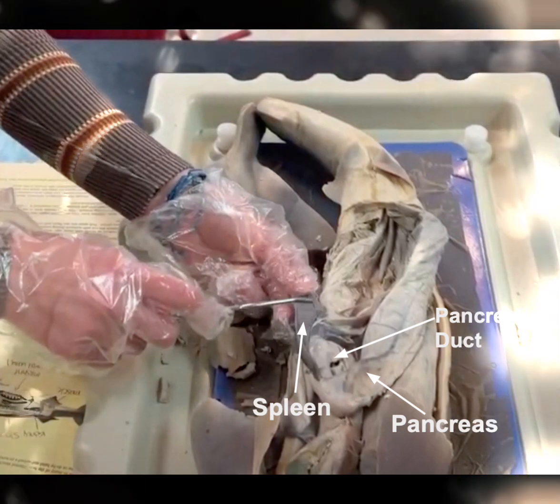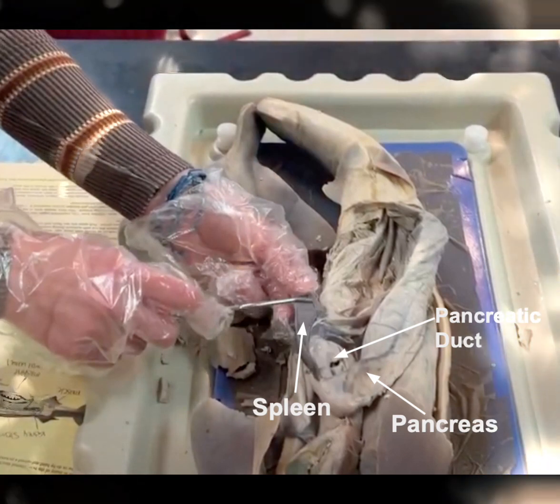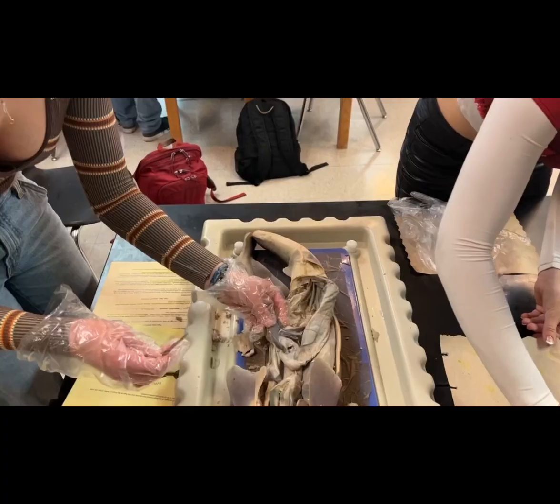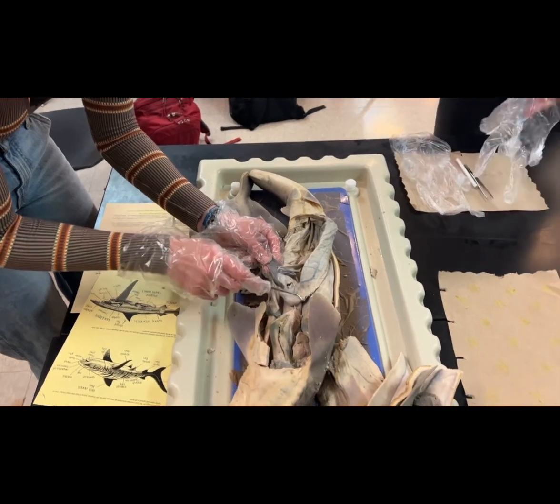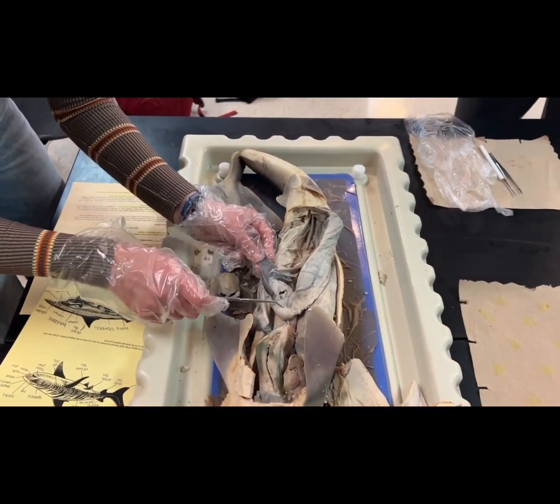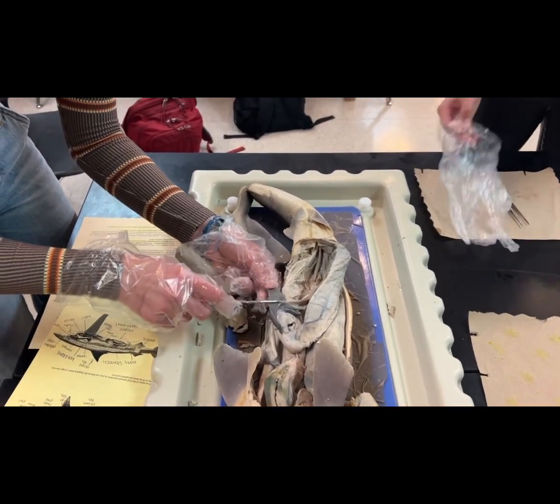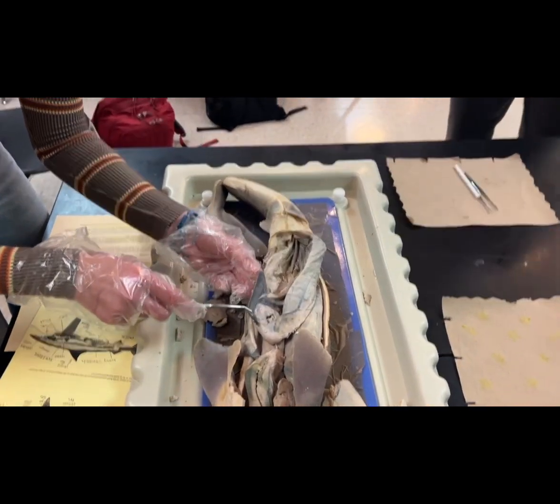The spleen's primary function is to store red and white blood cells. The pancreas secretes digestive enzymes and provides a passage for the enzymes to the duodenum. The pancreas, which is this part laying right here, secretes digestive enzymes and creates a passage for the enzymes to the duodenum. And the spleen stores red and white blood cells, which is this dark part right here.